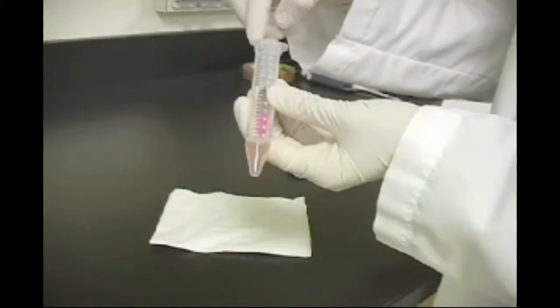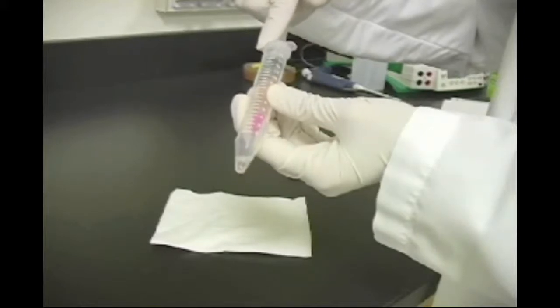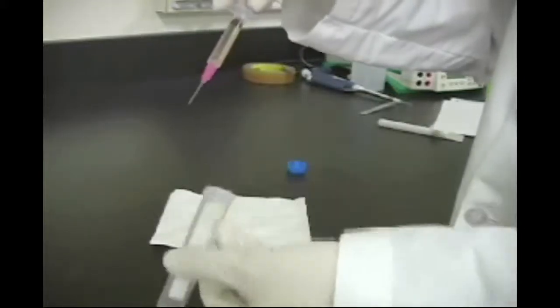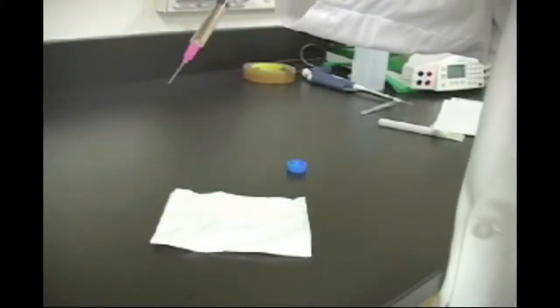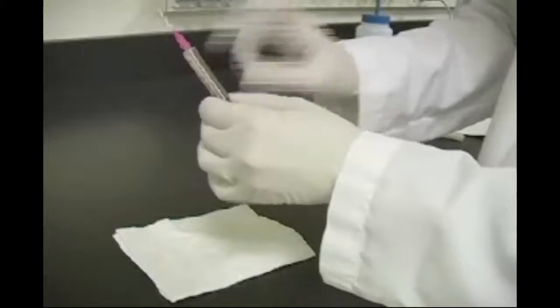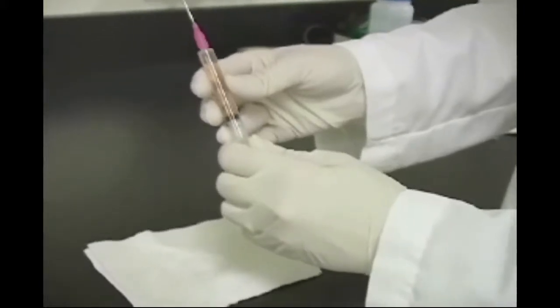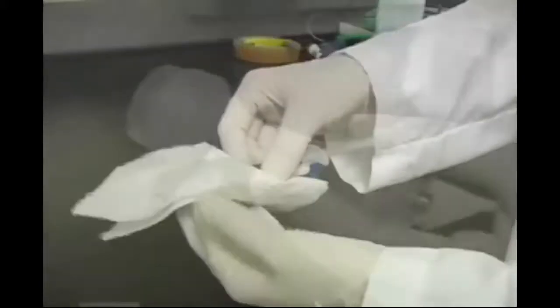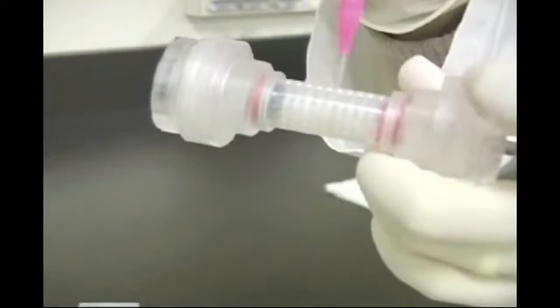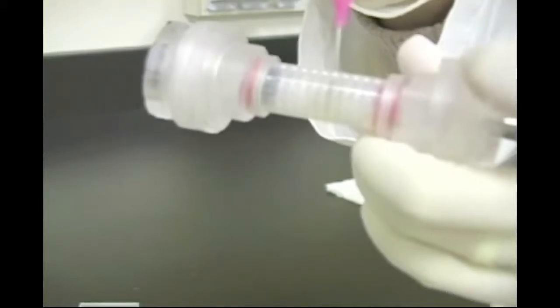Fill the 3 milliliter syringe with sample. Slowly load the sample through the center-most loading port of the focusing chamber. As this compartment fills, the sample will slowly spread and fill the adjacent compartments.